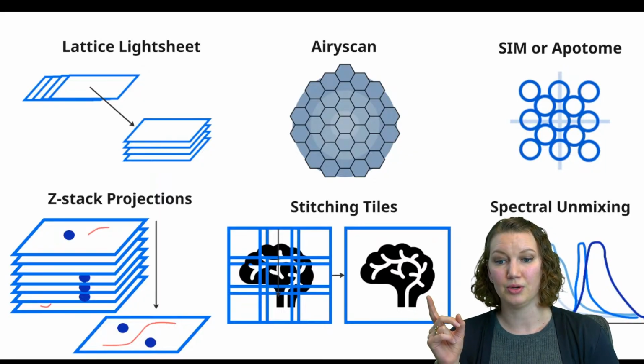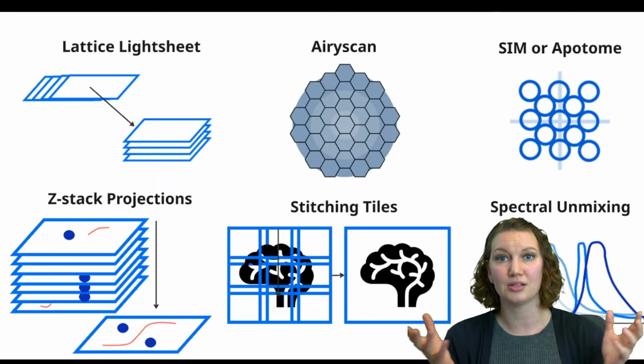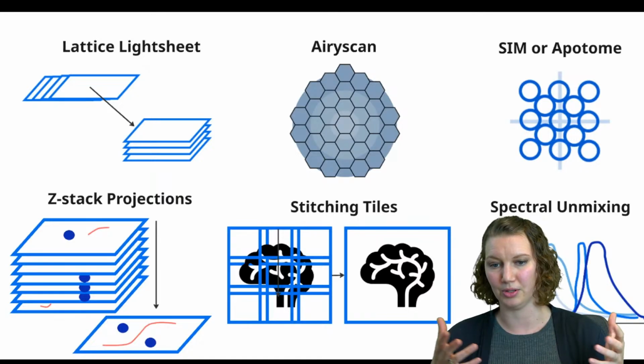But next I want to go into Airyscan, and so what I'm going to show you next is, this is a 32-channel detector for those of you who aren't familiar.